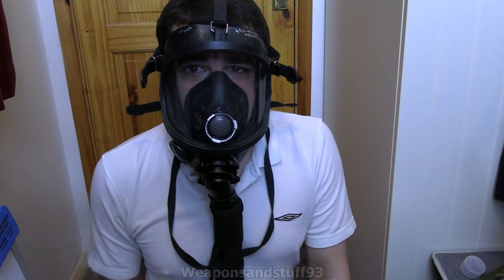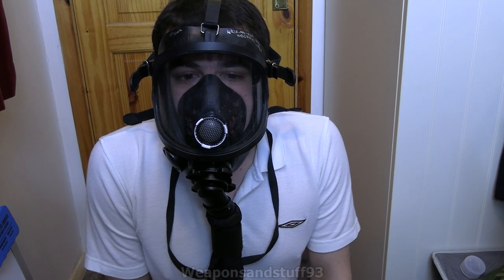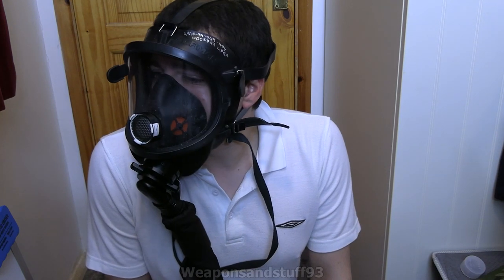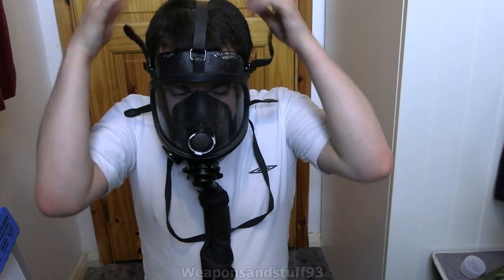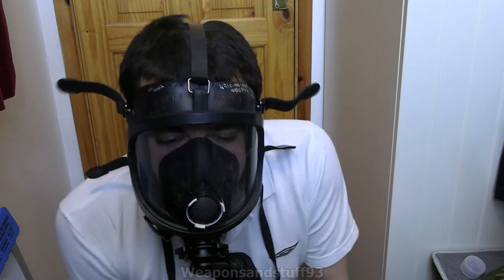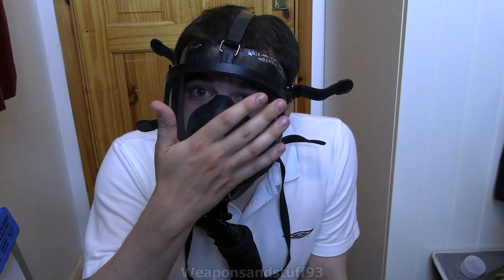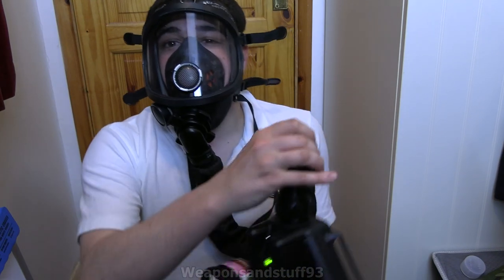If I hold my breath long enough, the air will start escaping on its own — let's try that. I think what it's actually doing is escaping from that gap there rather than the nose bit, so let me tighten the other straps up and try that again. There's a tiny bit of air escaping from there now — I can feel it on my hands. That works surprisingly well. More interestingly, you can hear the motor rev up and down a bit as I breathe.